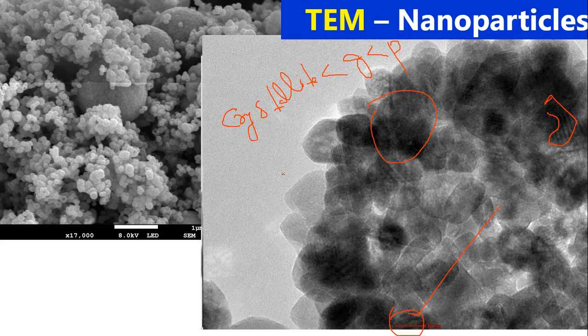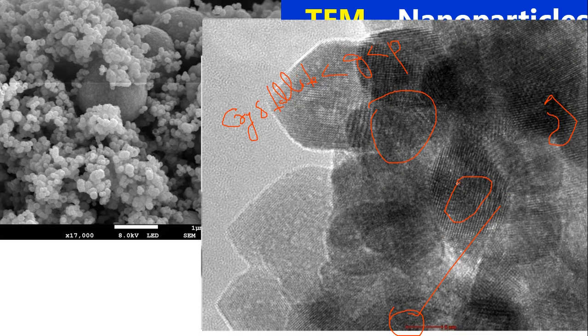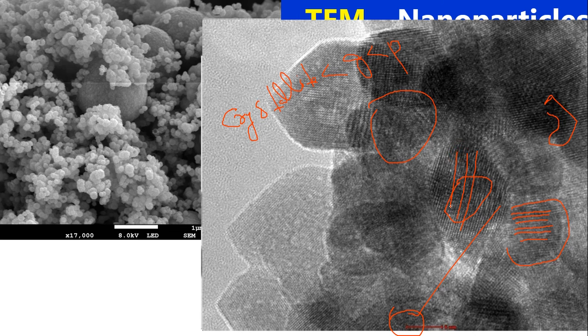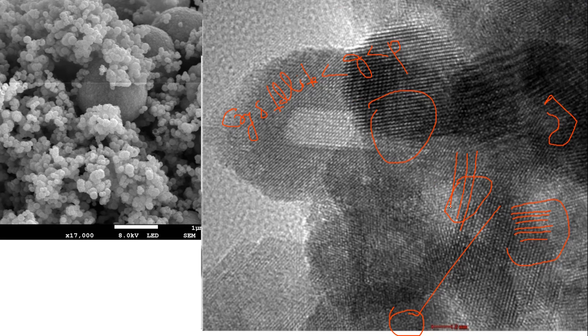Looking further, some grains are small and some are bigger. Zooming in more, we are now getting the lattice planes. Each grain has its own lattice planes and they are oriented in a particular direction. You can see the lattice planes where electrons are residing. This big grain has its planes oriented in a particular direction, and this other big grain has its planes oriented differently.